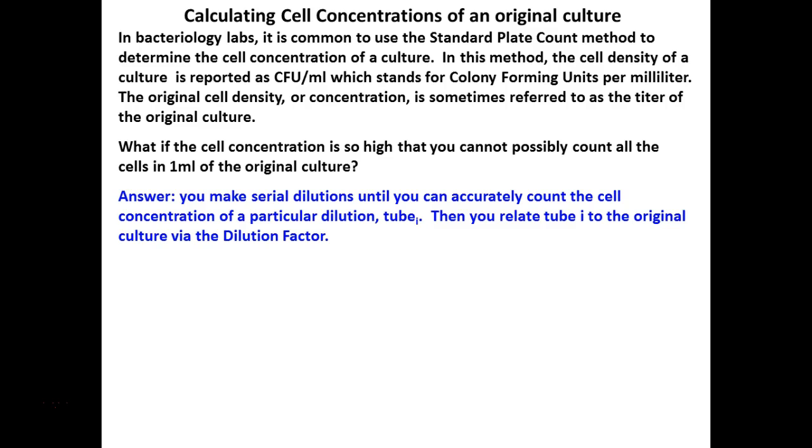Absolutely. Did you guys watch the video where they're filling up the different colored tubes? And especially when we're talking about the next one where they're just taking cells or particles, sometimes you won't even pick up all of them. So we have to take that into consideration, because if I put an entire mL on there as opposed to just 1/10 of a mL, is there less cells? Yeah, there's considerably less cells in 1/10 of a mL as opposed to if I put the whole mL on there. So I have to take that volume that I actually plated into consideration. Does that make sense to you guys? So that has to be in our equation.